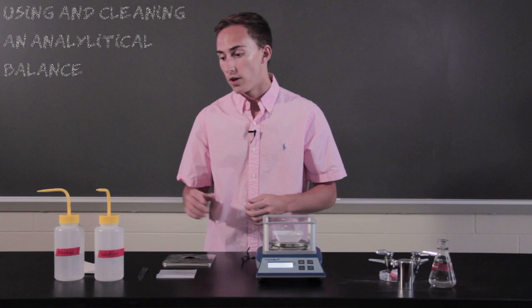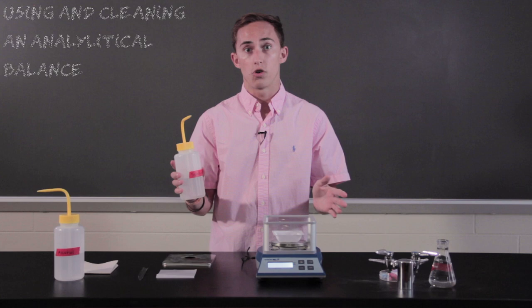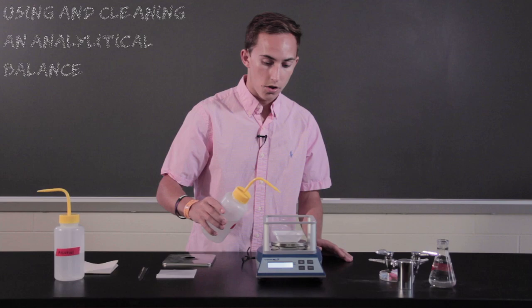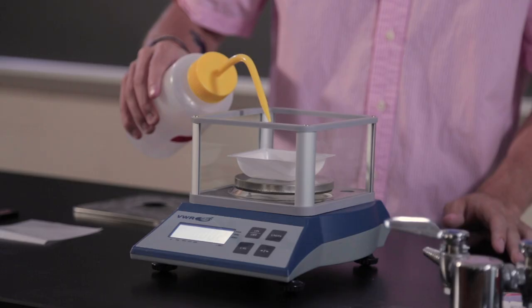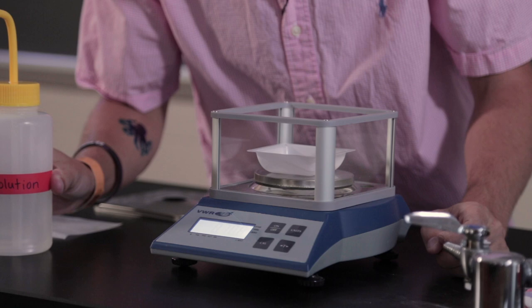So, we're going to take our solution, and we're going to measure out a certain amount. You'll have specific amounts of solution, or your sample, that your teacher will want you to do. But for this, I'm just going to show you that you will put in a certain amount, and you can see it's .708 grams.